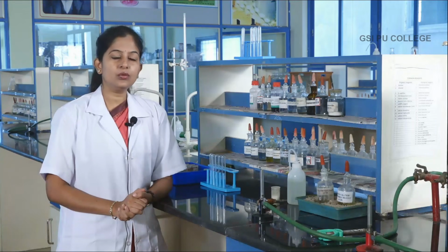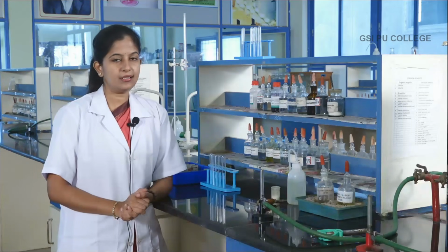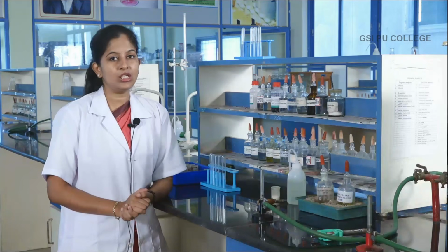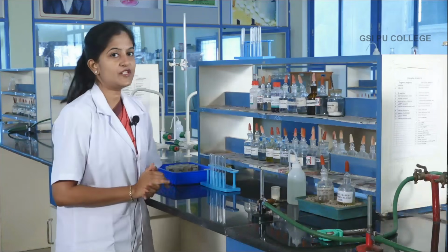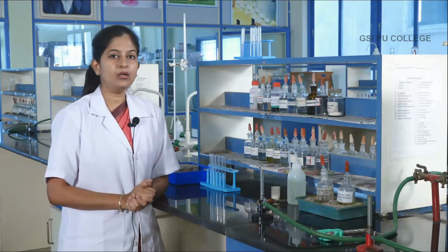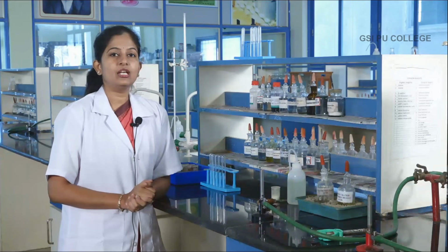In this session we will be analyzing a new inorganic salt, identifying its acid radical and basic radical, and working out the formula of the unknown inorganic salt given. First of all we have to go for preliminary examinations, studying the physical state, the color as well as the solubility of the given salt using your 5 senses.